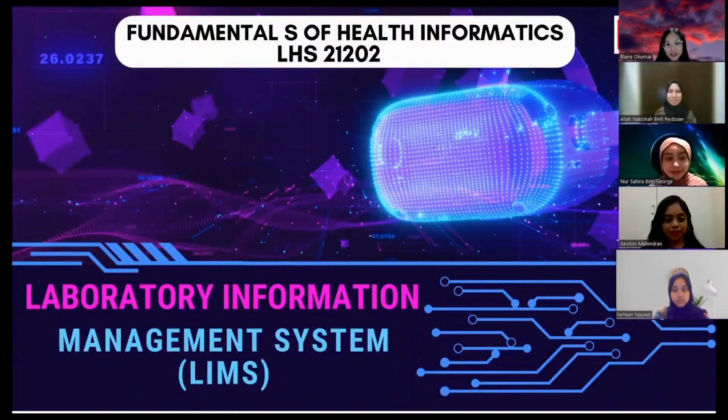Today we would like to present on our title, which is Laboratory Information Management System, or also known as LIMS.